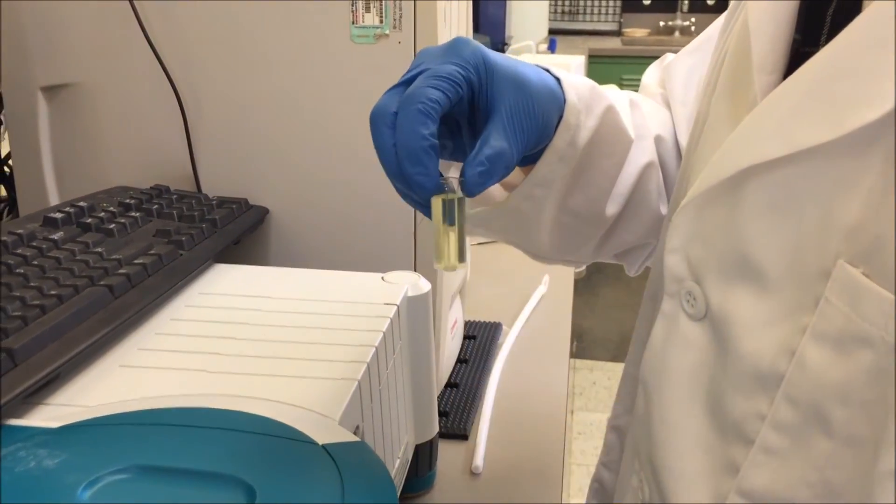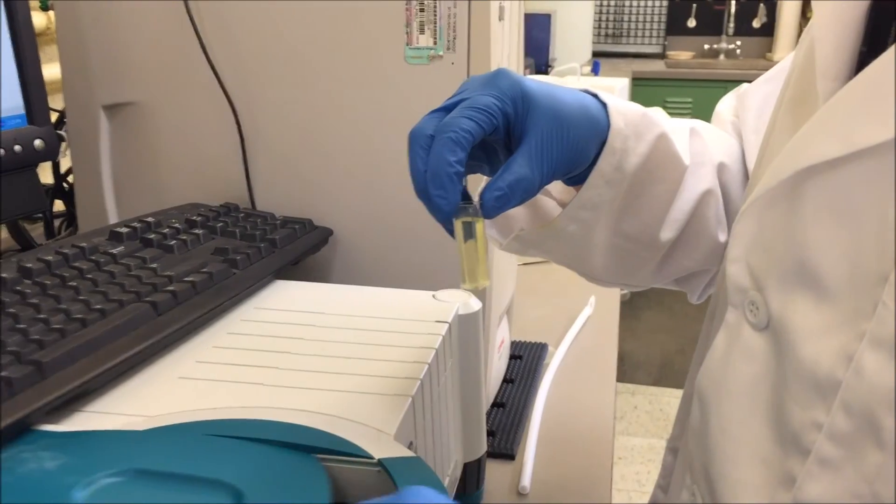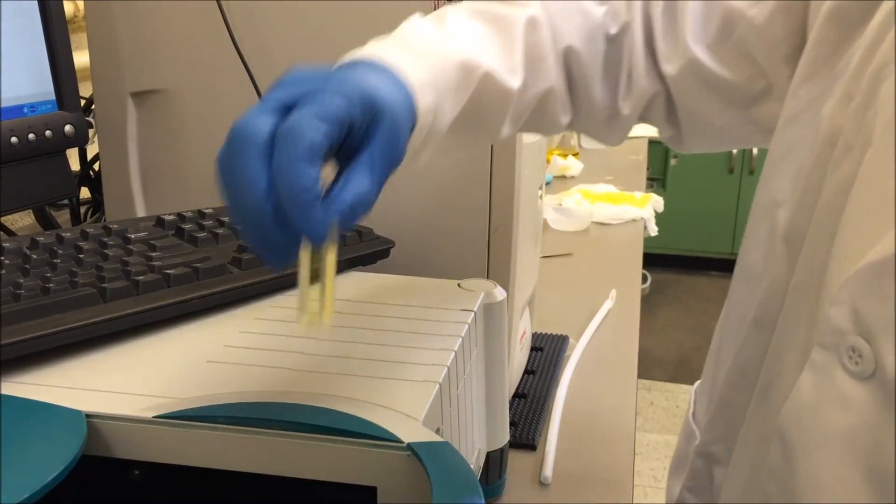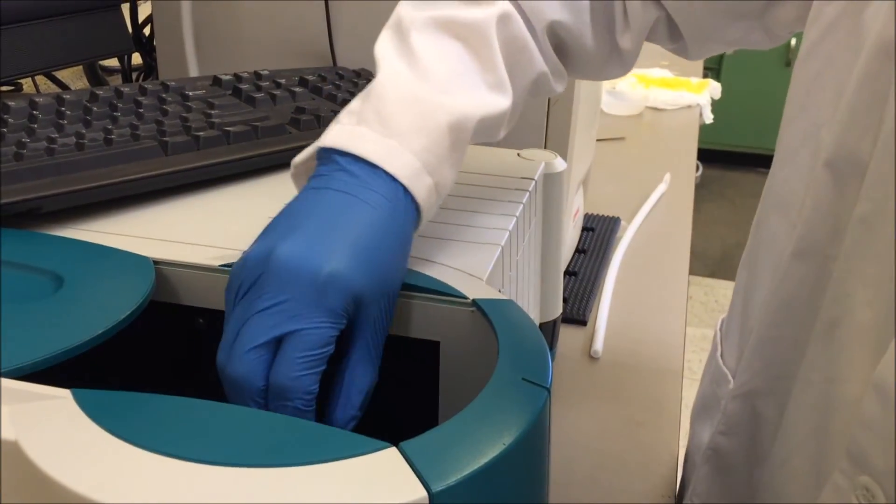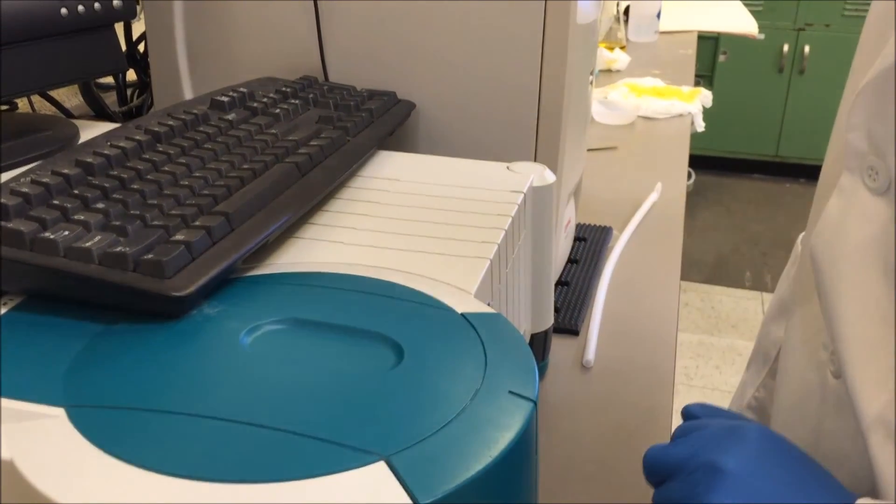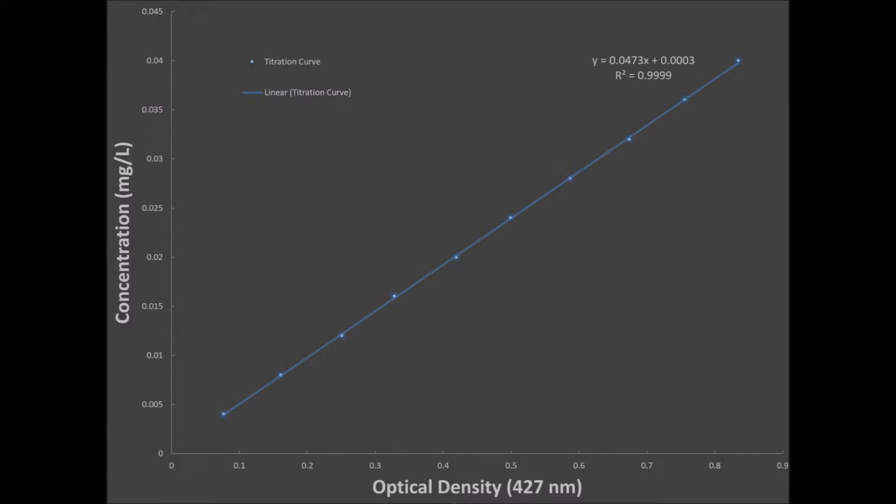When taking your spectrometer readings, first set your spectrometer to 427 nanometers and wipe your cuvette with a kim wipe. Then correctly place the cuvette in the machine as shown. This is our calibration curve.